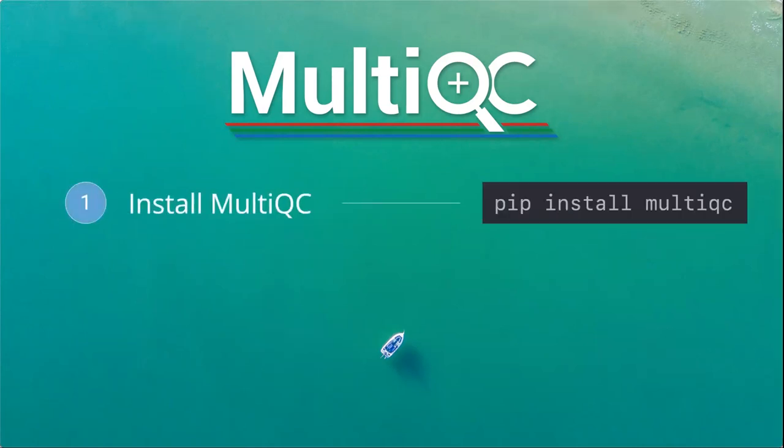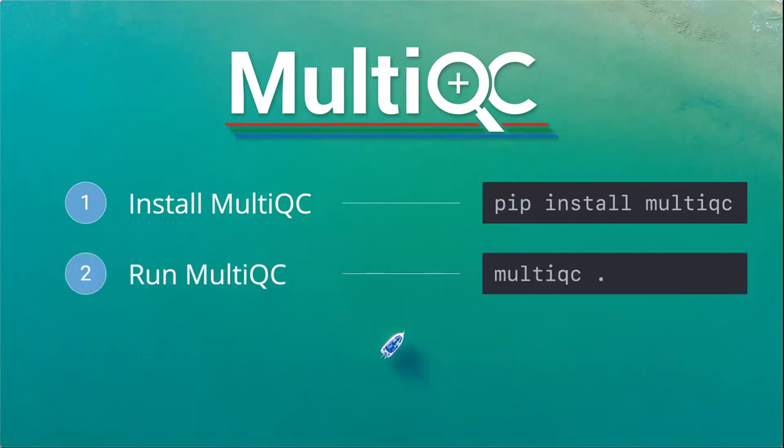MultiQC is written with Python, so it's pretty easy to install if you've got Python set up on your system. Using pip install MultiQC, it's also in Conda, or you can use it with Docker or Singularity, there's a Galaxy wrapper for it. Most places you're already running software, you'll find MultiQC there - there's a Debian installation and all sorts.